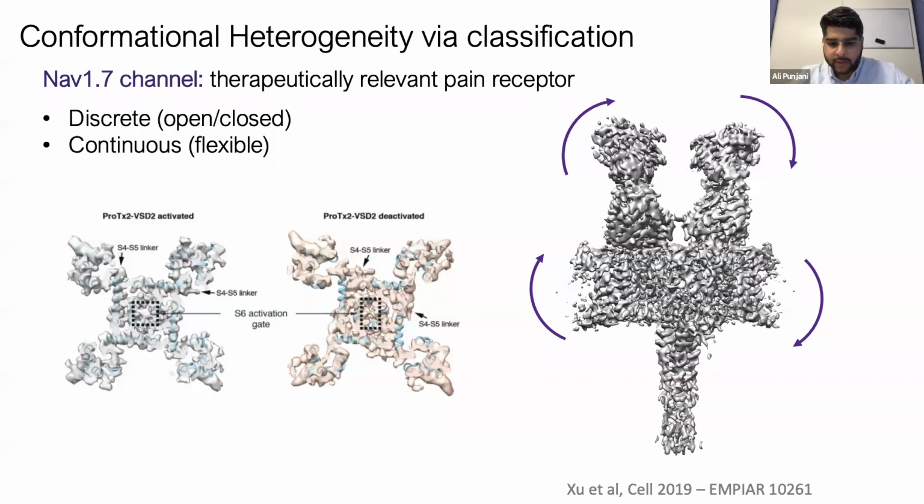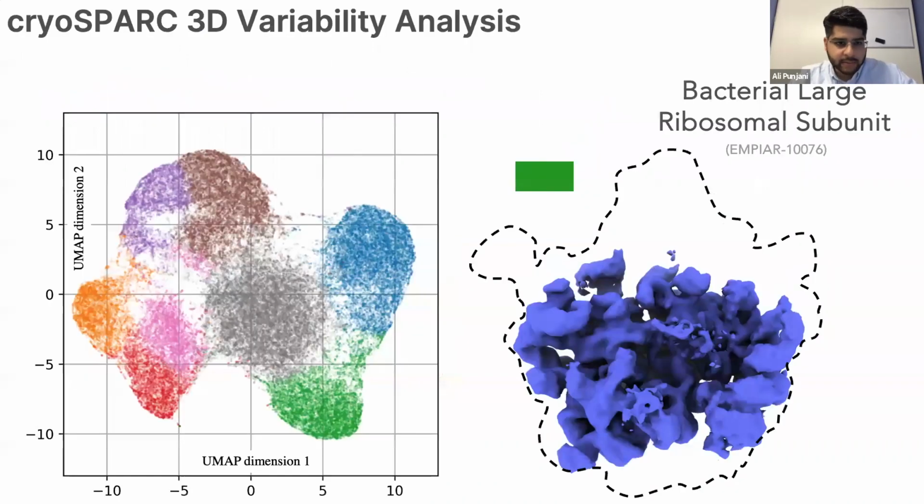So for example, what I showed with this ribosome intermediates, each one of these blue maps here is an independent reconstruction from particles that were just like, for example, this is the green cluster. So only the particles that were in this green cluster are used for this reconstruction. And that's automatically done if you choose the cluster mode, and you have to provide the number of clusters that you want to do.